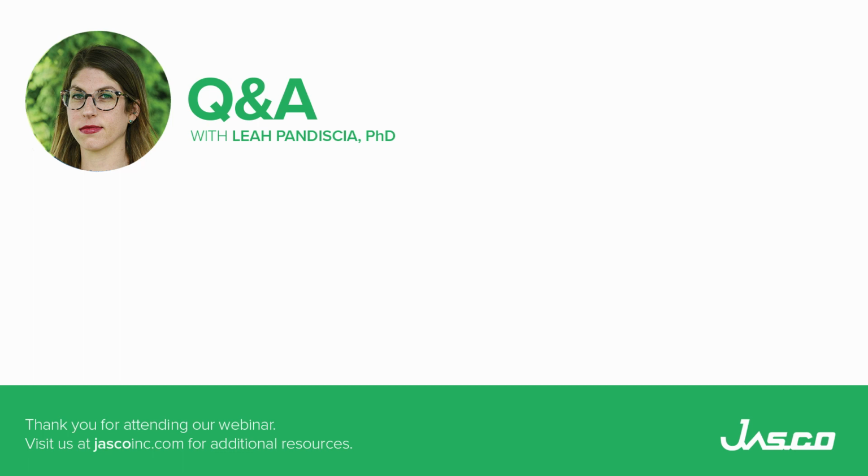It's even more important, something I don't know that we talked as much about, right, Leah, when you have high absorbance, it's really important to not just do your baseline and then your sample, but you also run a dark. So you end up running three measurements. You run your 100% line, your baseline, and then you block the beam and run a dark current, just any background noise of the instrument. And then you run your sample, and that's probably the best for really highly absorbing samples.